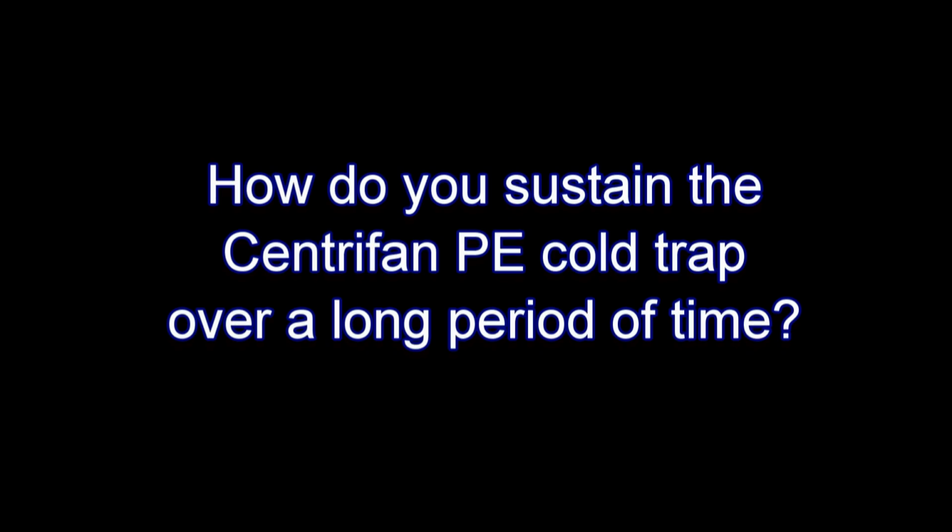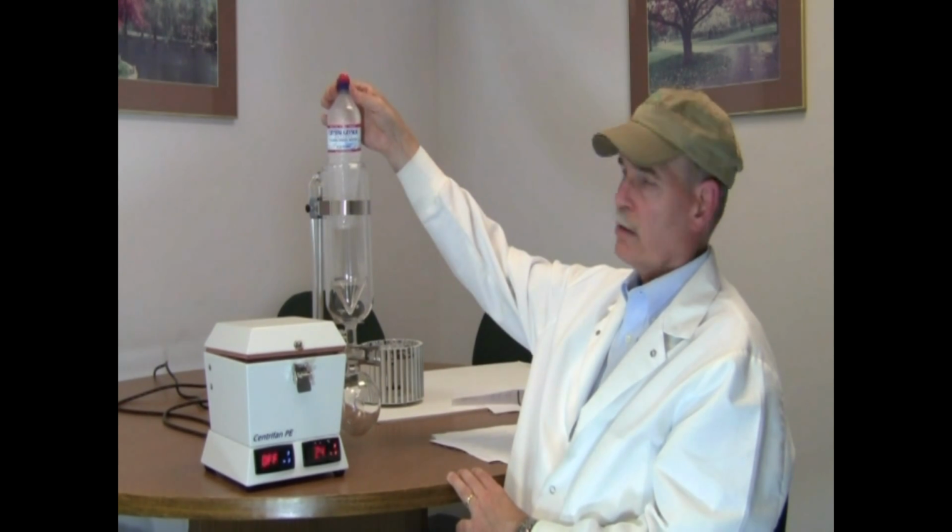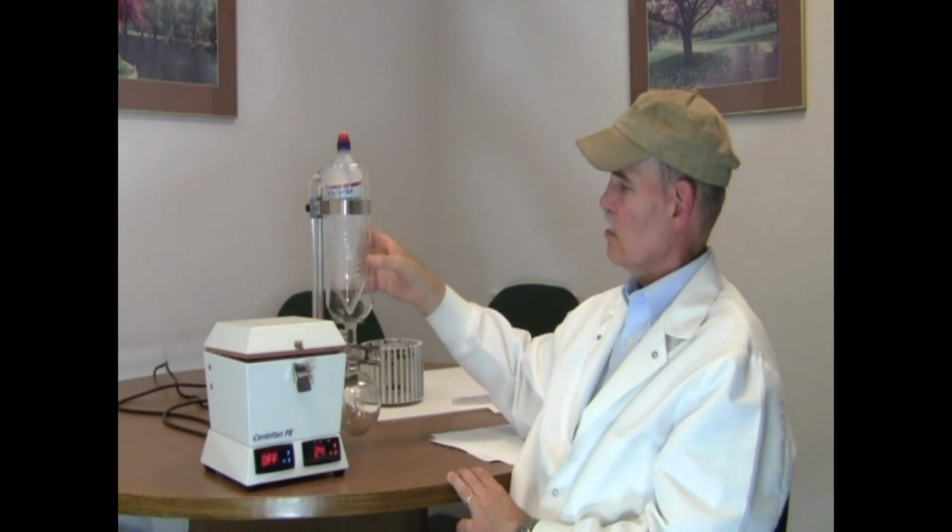How do you sustain the Centrifan PE cold trap over a long period of time? So it really depends on the solvents that you're working with. If you've got something like water or methanol, a frozen water bottle works just fine, keeps this cold enough so you get a good condensation rate.